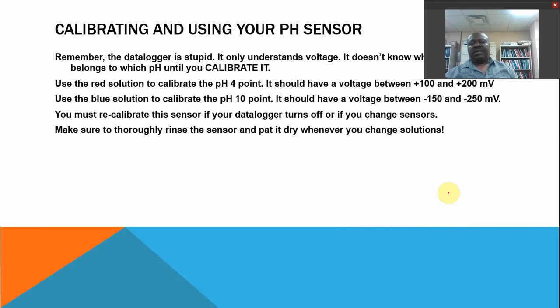You'll have to calibrate the pH sensor. There are directions for that in the lab manual. After you're done calibrating, come back and measure the pH of the standards. Is it recording the right values? If that's true, you're good. If not, look back at the directions and see if you missed something. And if it fails the second time, then talk to your TA.